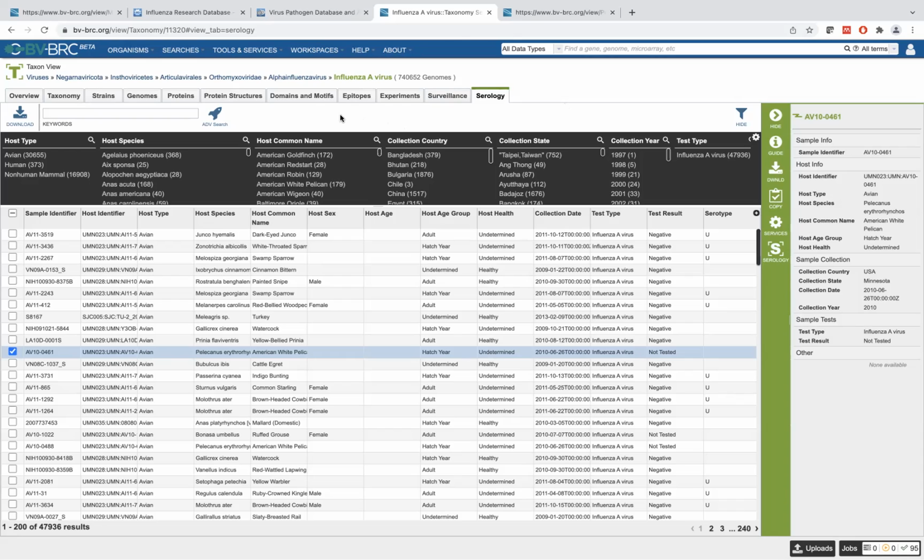If you have a very large, very mixed metagenomic data set, it's going to be slow, and it can take minutes to maybe a couple hours. And if it's just a few small reads that have been binned through the binning service, for example, or through the FastQC utilities, then it's a lot faster, and then it's minutes.